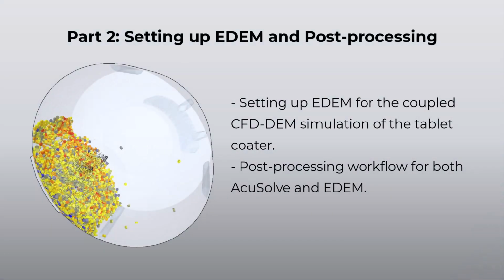This tutorial will guide you through setting up an EDEM simulation for an EDEM CFD coupling in a tablet coater. It will also cover the post-processing workflow for both AcuSolve and EDEM.